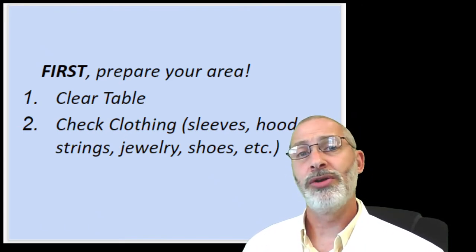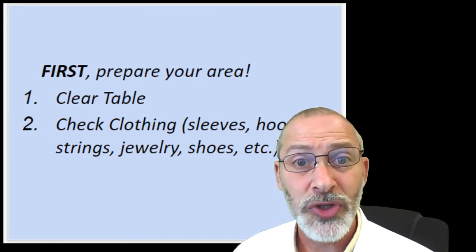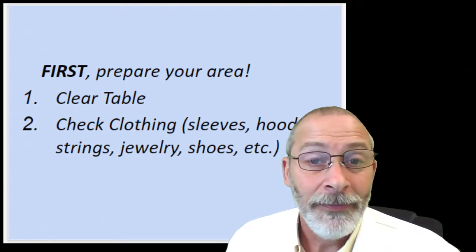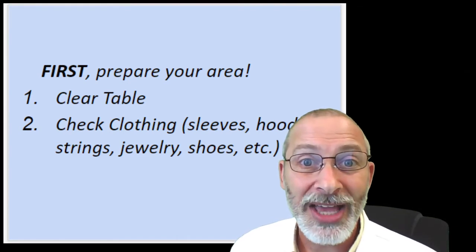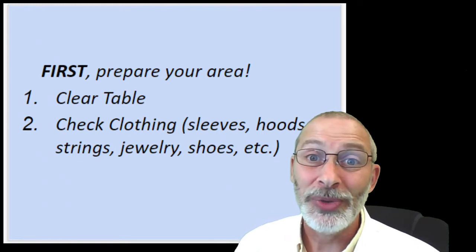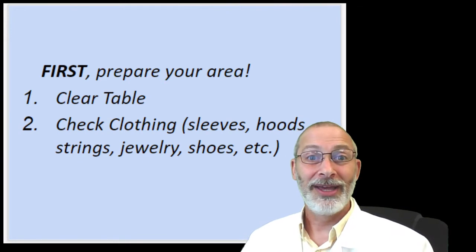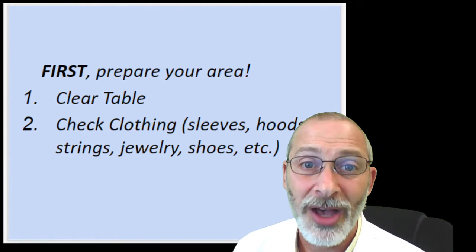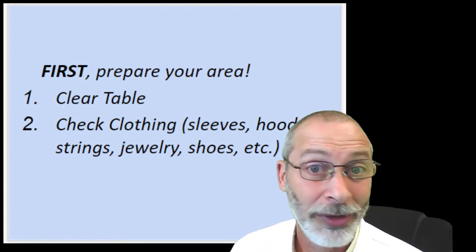Your clothes are your body's first line of defense if something were to happen. If you have a chemical spill or sparks shooting off, as may happen, you want your clothing to protect you. But if you've got bare flesh below the table, your skin is not going to protect you from the sparks shooting off the table from the Bunsen burner as we're performing experiments, and likewise with your feet. Your feet have to be covered. No bare feet, no exposed flesh below the table, period.